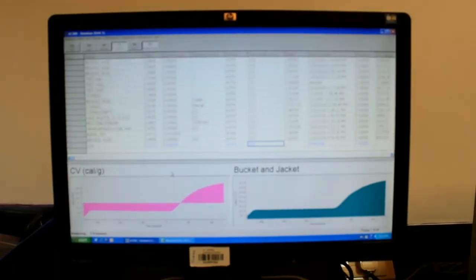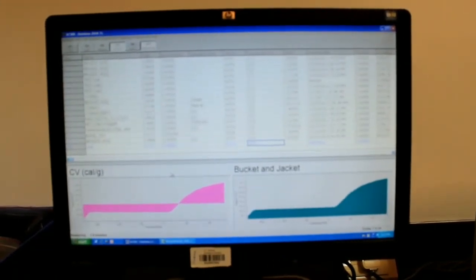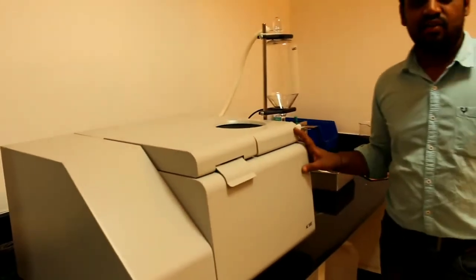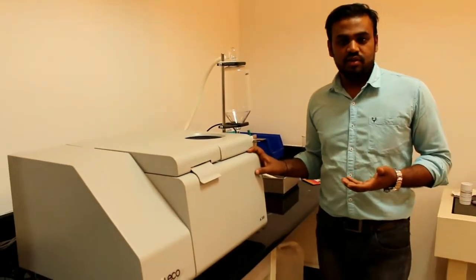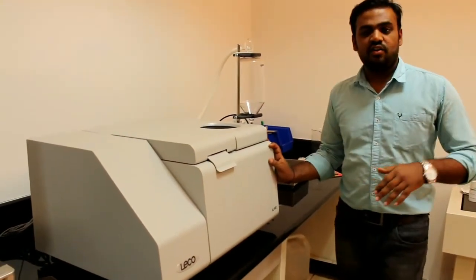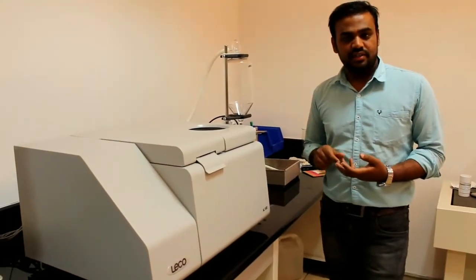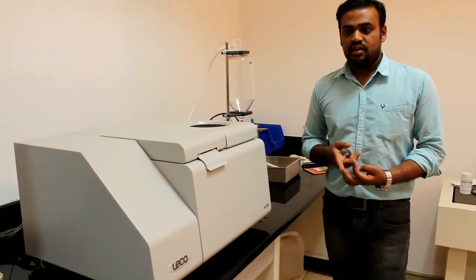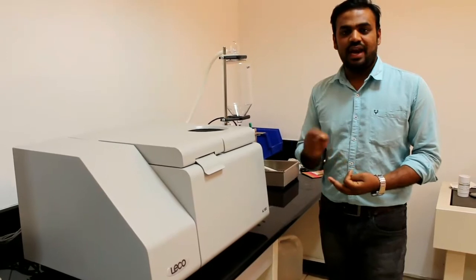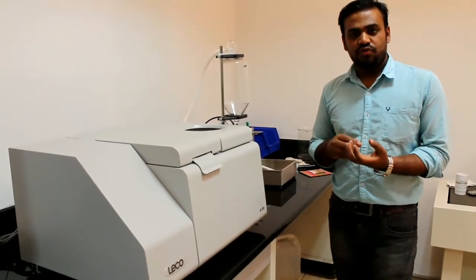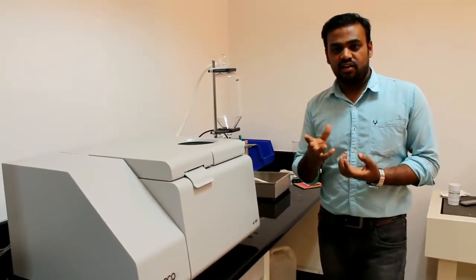And the delta T is rising, we can observe this one, 0.58 delta T, change in temperature. In this instrument, we can also measure very low content of CV also by using spike method. Spike method means high content of ash. Some samples will be high content of ash. In this case, we used to add some kind of known value sample like benzoic acid or any known sample. We will add that one. By using that known sample, it will get fire, and it is used to fire with the sample which has high content of ash.